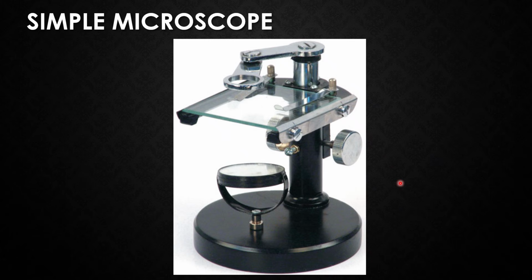This is the simple microscope which was used during the initial days. The format of this simple microscope is very simple when compared to the currently used microscope. See here, no condenser, no objective lens, no nose piece, no eyepiece, and there is only a single adjustment. This is the very simple format of the simple microscope which was used in the early days.